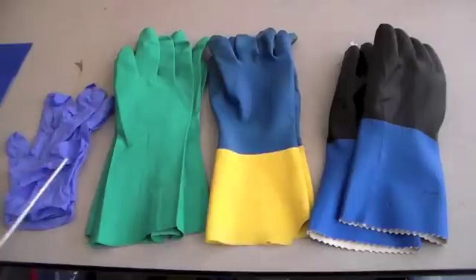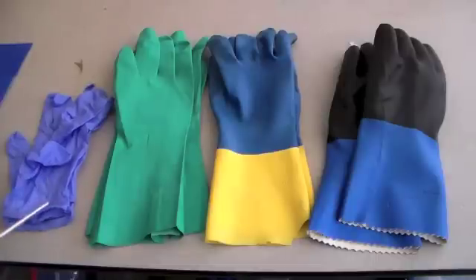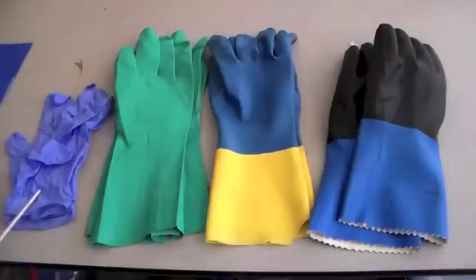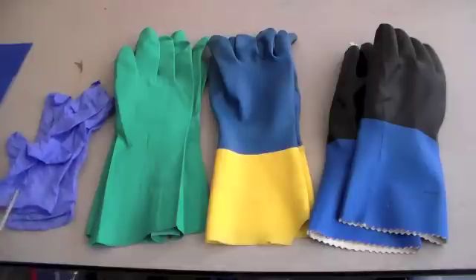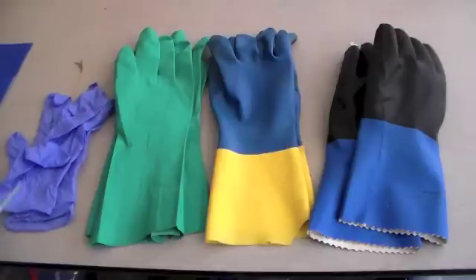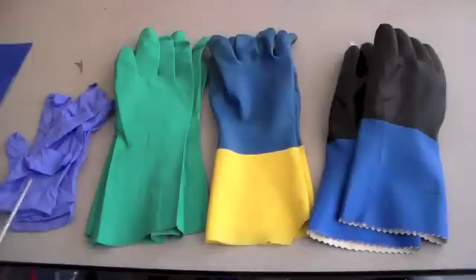Next, we have disposable nitro gloves — these are the most commonly used ones. They can be used for dilute acid and base solutions, aliphatic hydrocarbons — those are alkanes like hexane — and alcohols. These are pretty much the general use gloves because a lot of people are allergic to latex, so these are definitely a good choice, obviously not for substances like nitric acid.